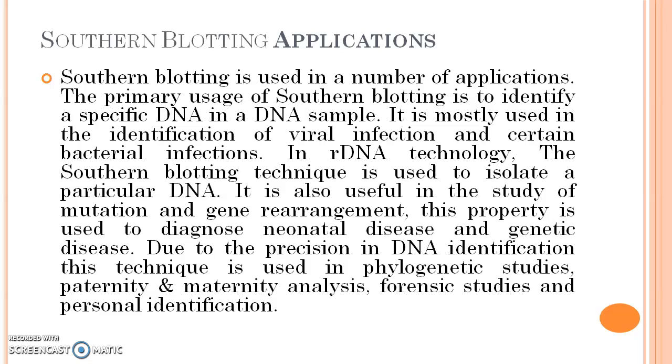In rDNA technology, the Southern blotting technique is used to isolate a particular DNA. It is also useful in the study of mutation and gene rearrangement. This property is used to diagnose neonatal diseases and genetic diseases. Due to the precision in DNA identification, this technique is used in phylogenetic studies, paternity and maternity analysis, forensic studies, and personal identification.